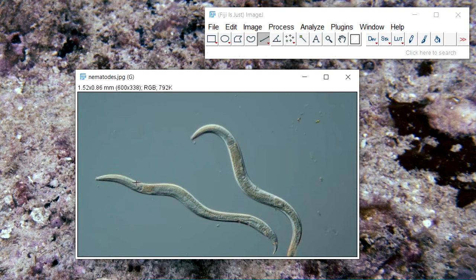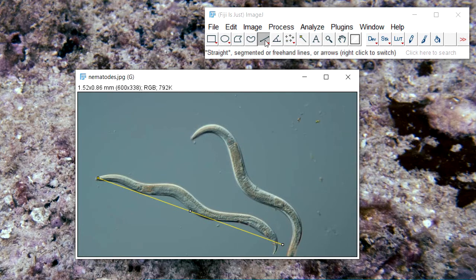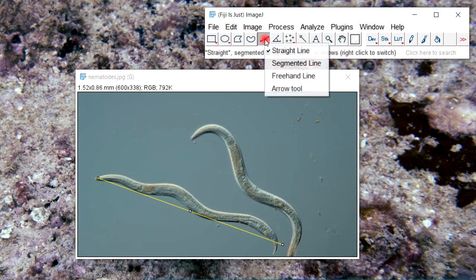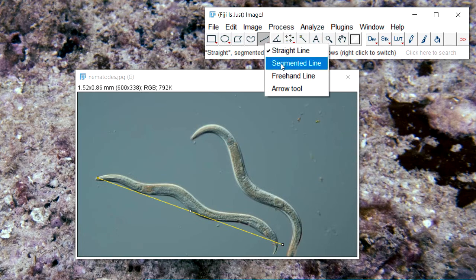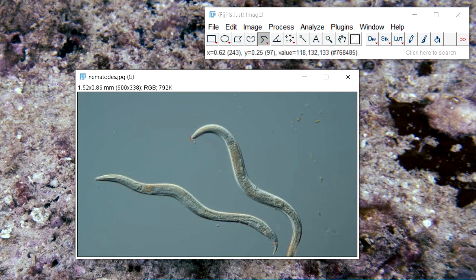To now measure the nematodes, we don't use the normal line tool — as you can see, it doesn't follow the curves of the nematode. So what we'll do is right-click the line tool and choose Segmented Line. From here we left-click to start the selection.